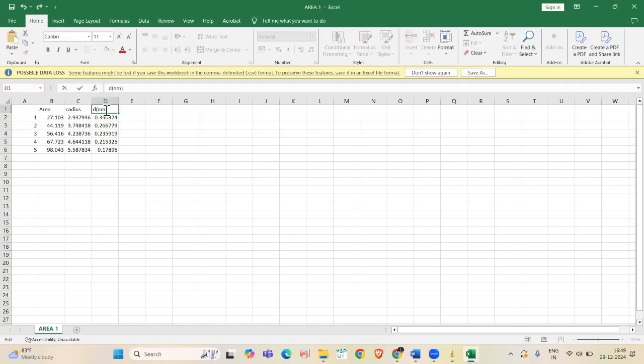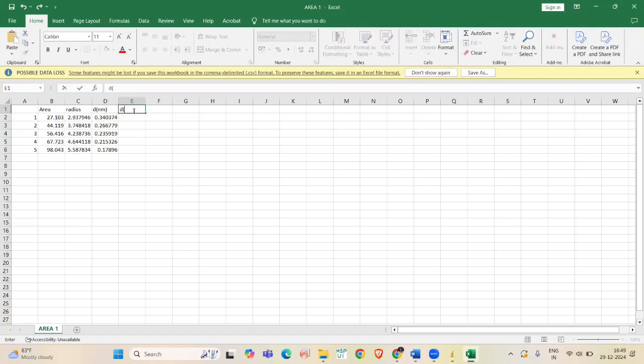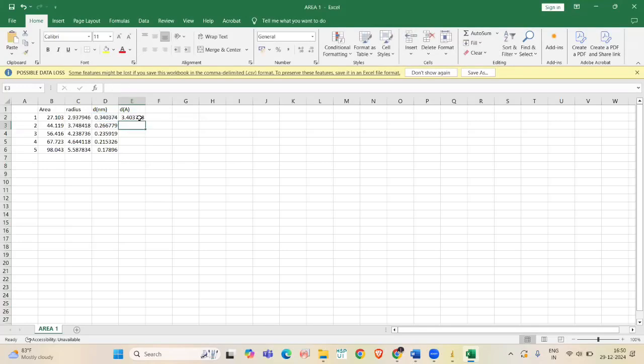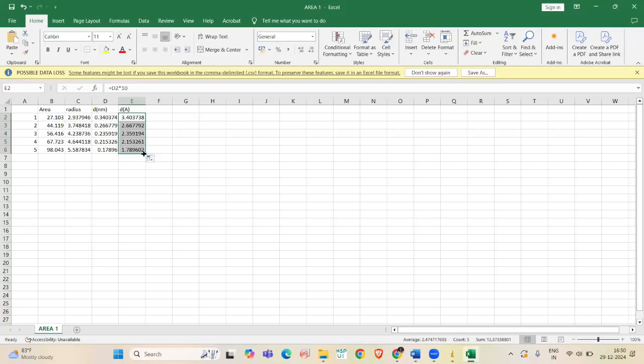Here, we have to convert this into Angstrom. For that, we using the formula equal to cell number D2 into 10. Now, we have this D value.